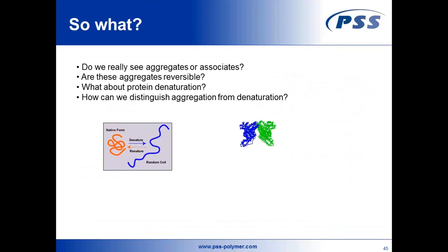Before we started to do the final proof, we took this analogy for our protein. When we go to the denaturation, when we denature our protein from a globular to the denatured state, then the density of the protein should decrease.